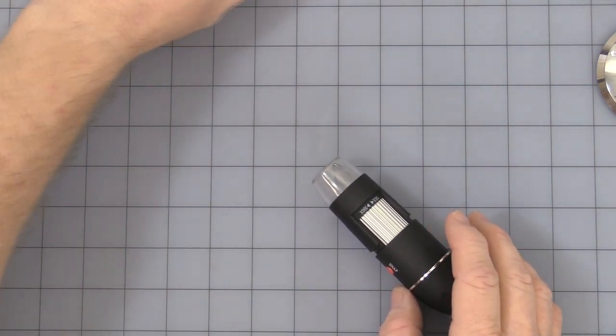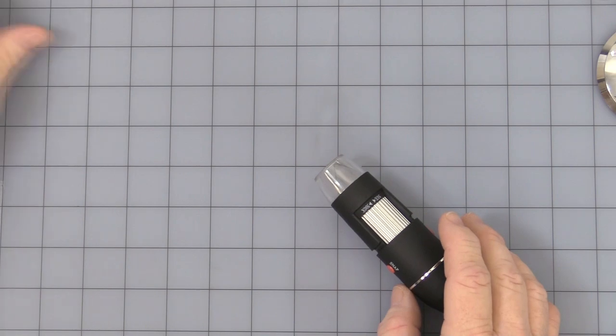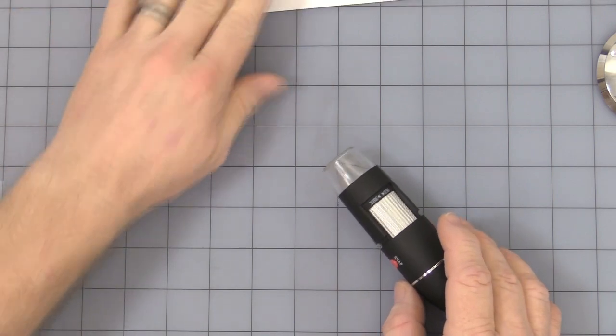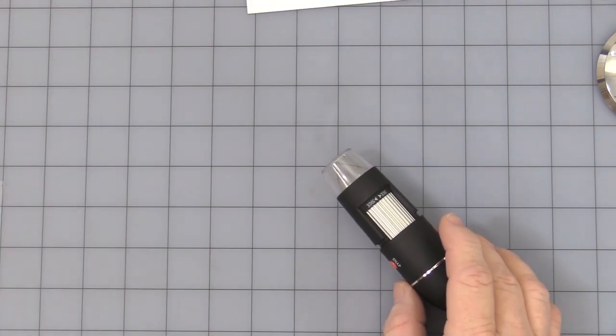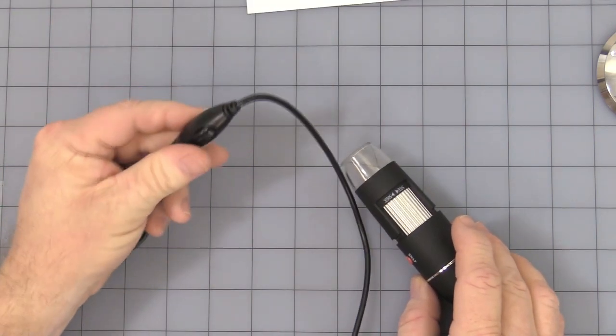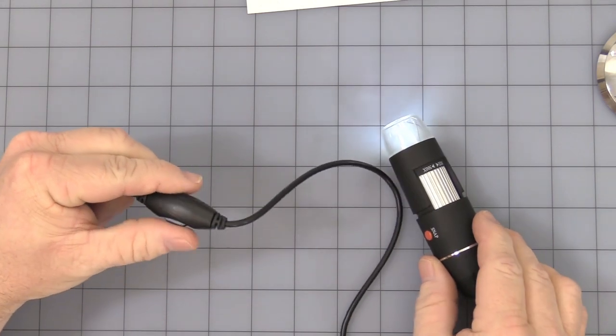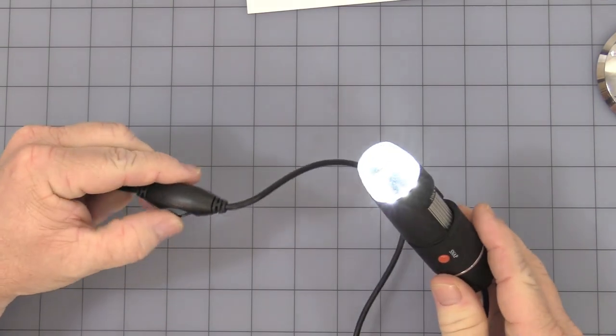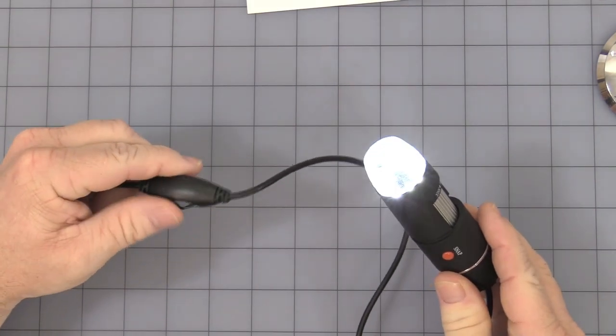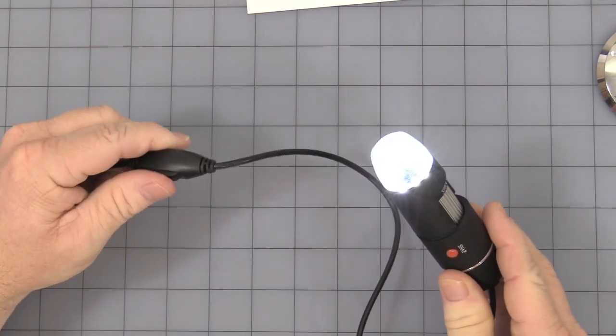But let's try it in some real world applications. First off, you have on the cord a LED light control, you control the brightness.